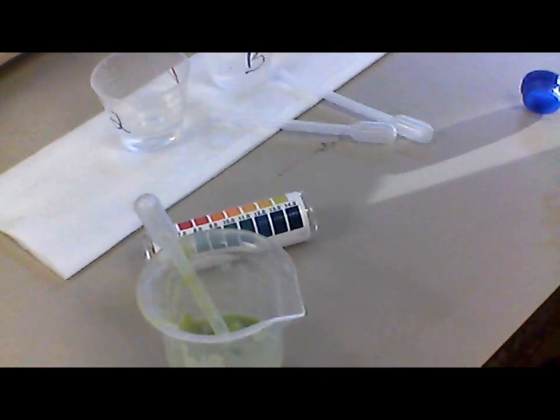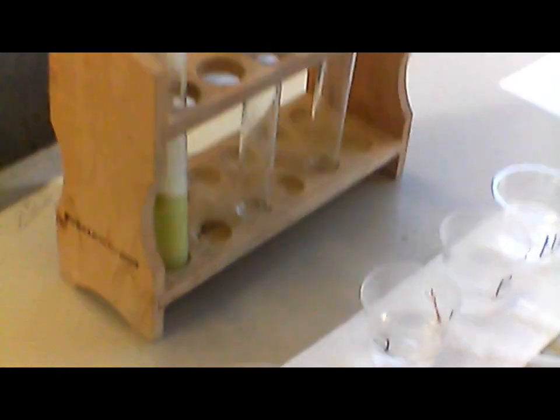Alright, next we gotta do 30 drops of avocado into an empty medicine container. That's this. Which one is it? I think it don't matter, it's either one. Yeah, they're both the same. Okay, because it's a medicine cup here.